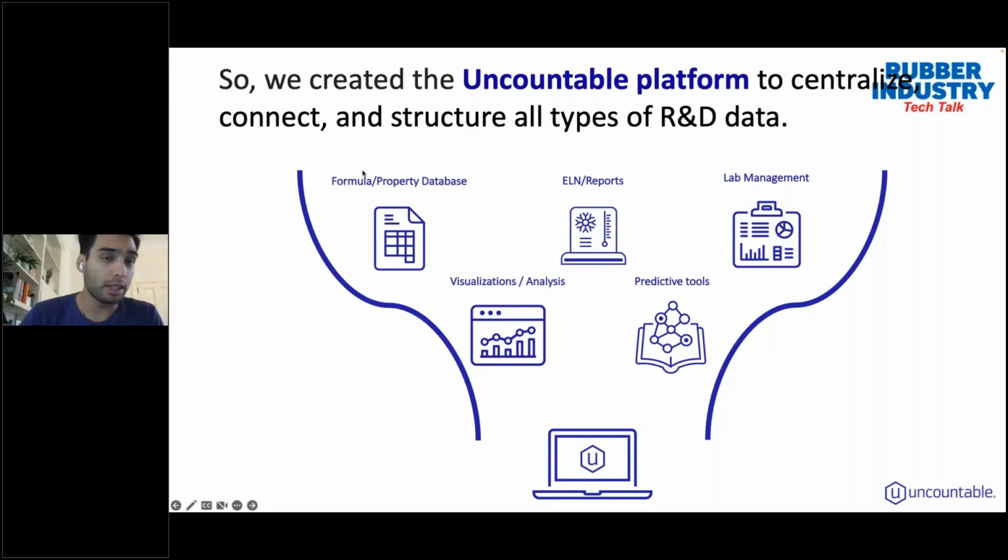We have your formulation, ingredients, and process parameters on one side of things. And on the flip side, we have your corresponding measurements. But as you add any additional layer of complexity, maybe a complex experimental workflow, maybe a part A, part B mixture, maybe some ingredient attributes or some stoichiometric ratio, or some cost variable you need to keep in mind.